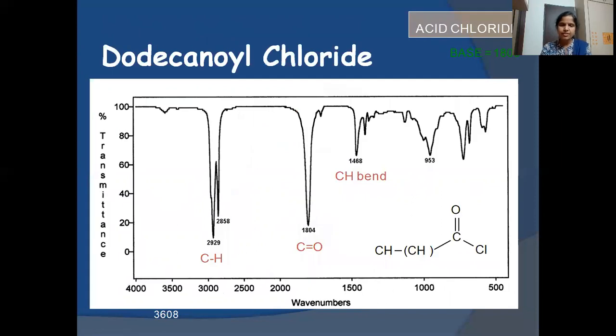Then we are taking the acid halide. Here the CH3 and CH2 are missing. Just now this is an acid halide. You just look at this C=O Cl. Now what are the bands that we have to find in IR for this functional group? Again the C=O is highest, because acid halides appear at higher frequencies. The C=O band is at 1800, very intense, strong bands.